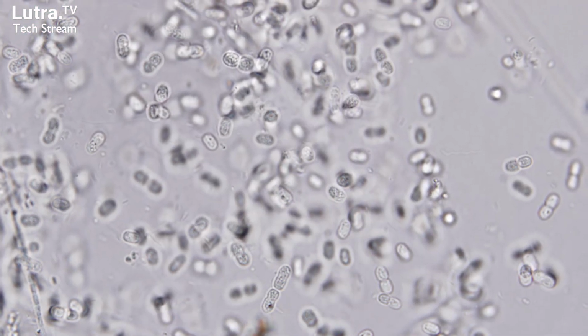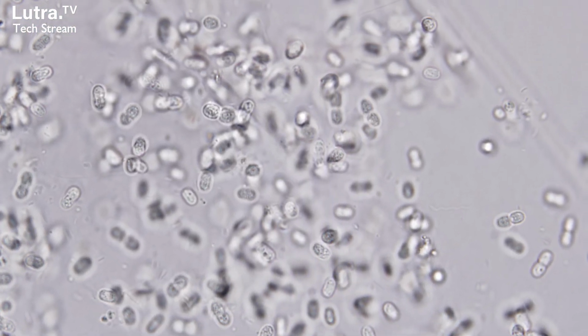Do the samples need to be alive? That's a good question. If in the sample there might be some grazers, the cells can multiply and alter the nature of the sample from when it came out of the field. So what we recommend is that they are preserved upon taking. A sampling officer would scoop the water up and add some Lugol's iodine, which is the preservative we recommend, and then send it to us at the lab.